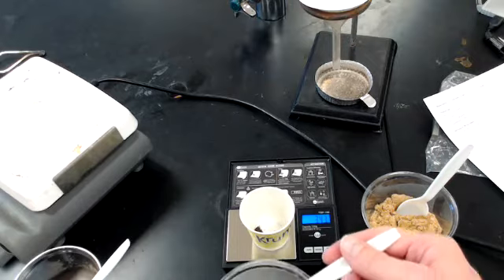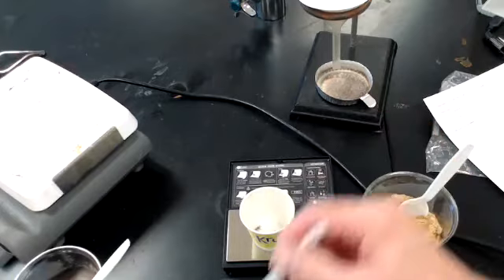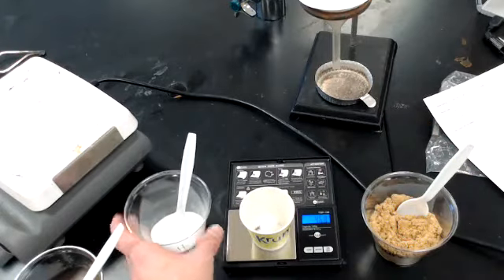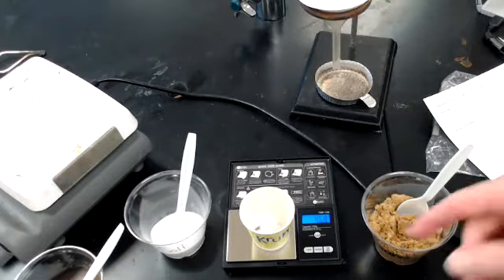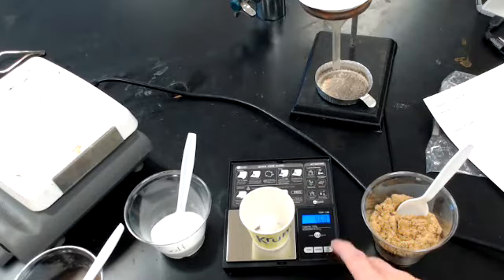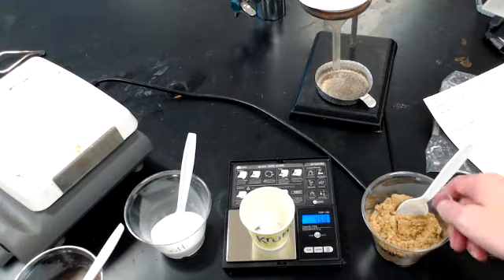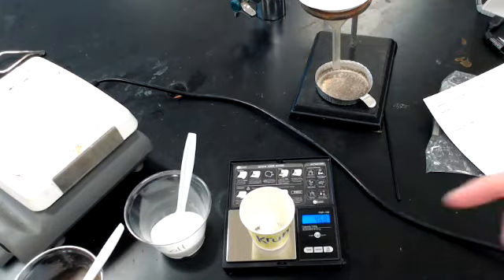And in adding some salt to it, I'm going to have, there we go, 4.68 grams. Be sure you write down, this is iron and salt in the container, 4.6, well, I guess I said 8, and now the wind currents are changing it. Hold up. Okay, 4.68 grams.